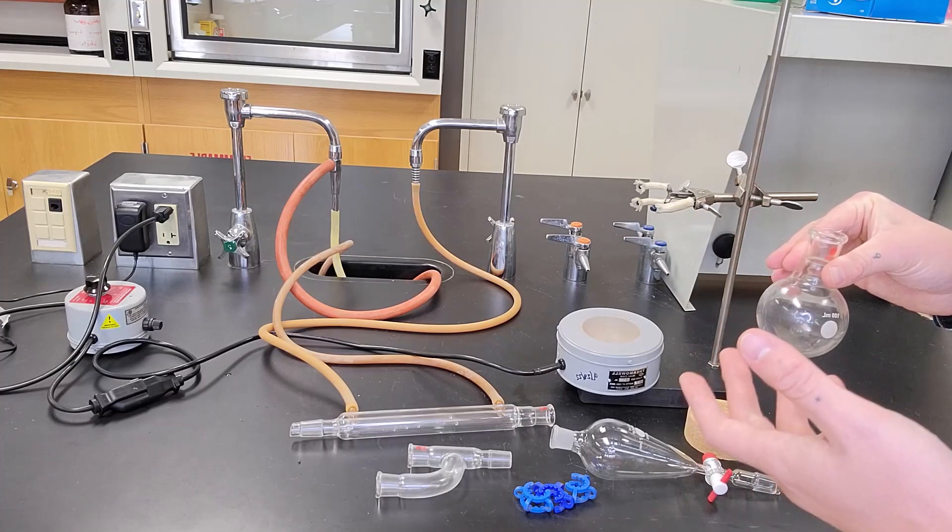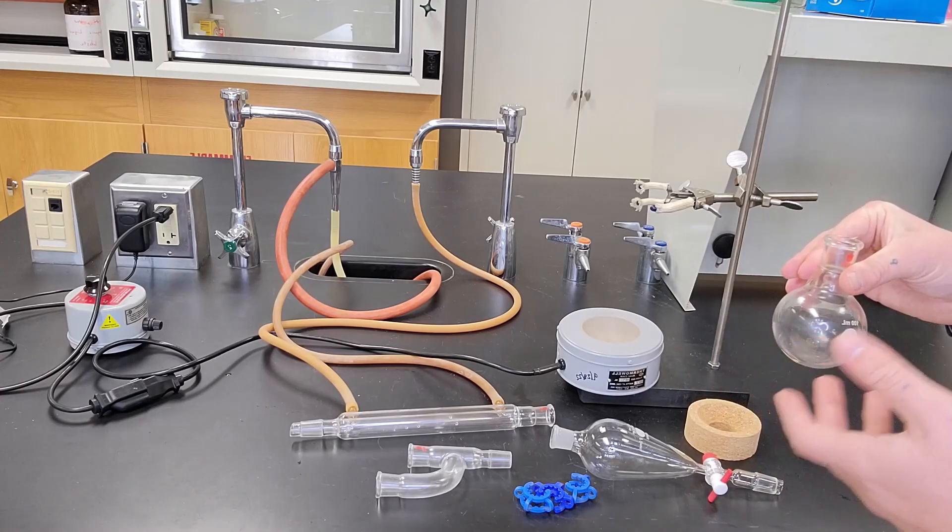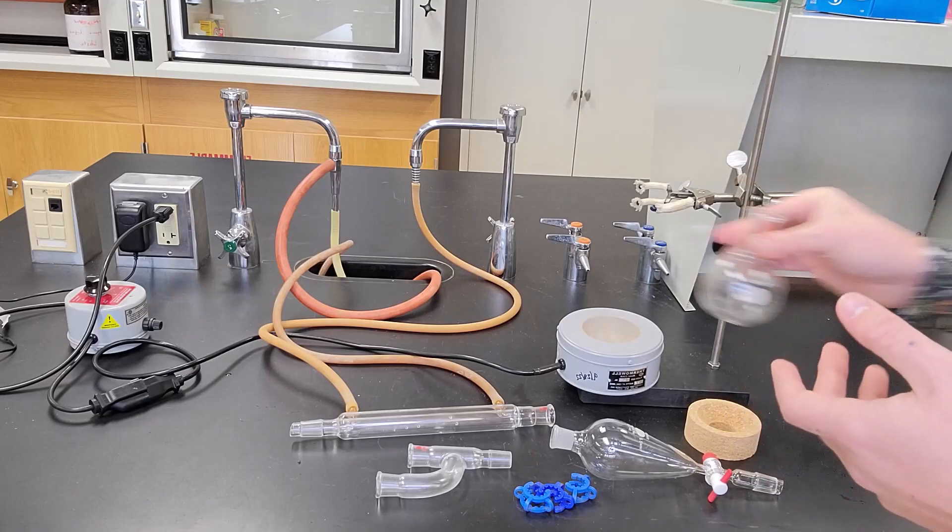But depending on the temperature you need to heat it to, in this case, in the case of our reaction, we're not actually heating it. It would just be clamped. But if we did need to heat it, we could use a water bath, an oil bath, a heating mantle, depending on the temperature we would need to heat it to.